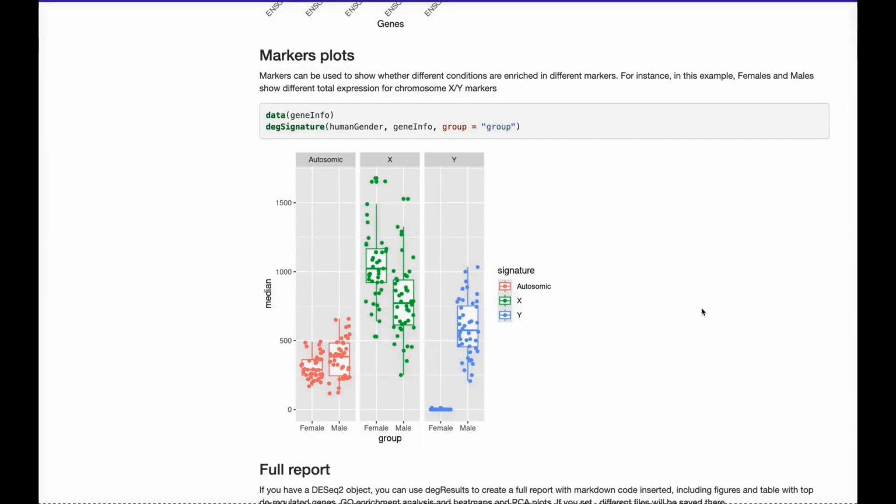This is a very interesting option where there seems to be a possibility to test gender in your sample, or to test whether genders reported in your sample table are as they should be.